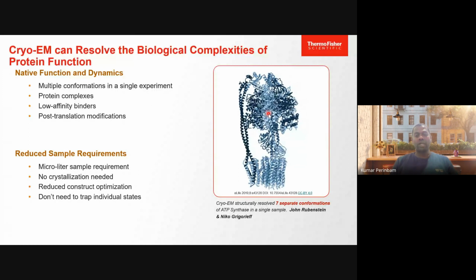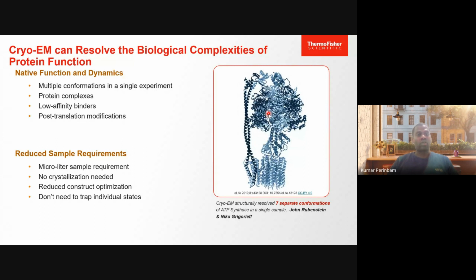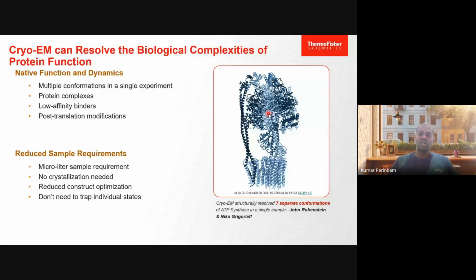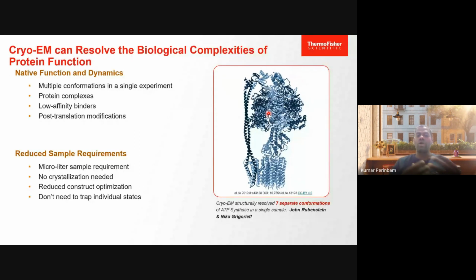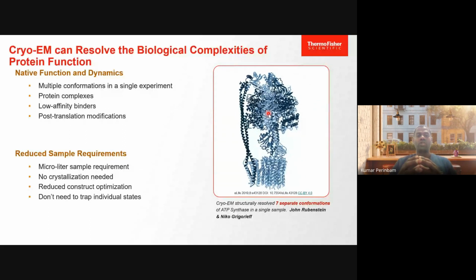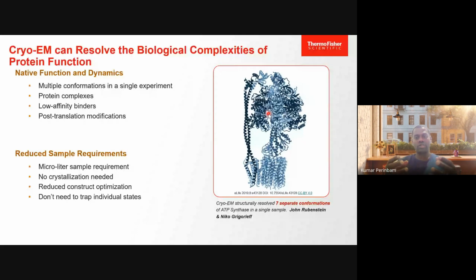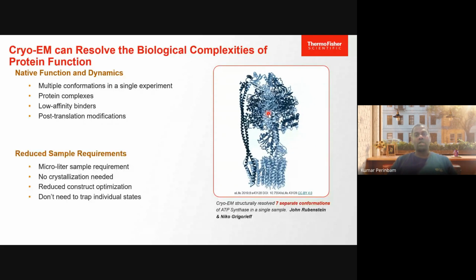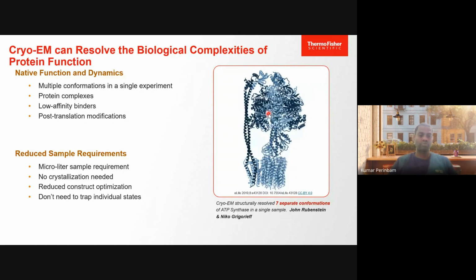biology was not far behind to adapt it, and in recent years the cryo-electron microscope has become the major tool to observe structural change, which indirectly determines how a protein or a biomolecule functions, and how the functions of all these biomolecules synchronize together to maintain cellular organization and even cellular function. And in some sense, it dictates what we do, what any life would do.